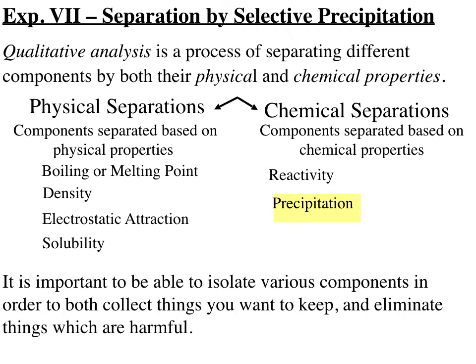So the first thing we're going to do is we're going to have a mixture. And in this mixture, it's often important to be able to separate the components of the mixture. There are several different tricks that chemists use to take a mixture and separate it into individual components. First of all, we probably should recognize why that would be important. When you're doing a particular chemical reaction, there are often other products as a result of that chemical reaction that are really not of interest, not economically viable or useful or particularly wanted around. So you have to be able to separate various components of the product mixture to get to the ones you want.